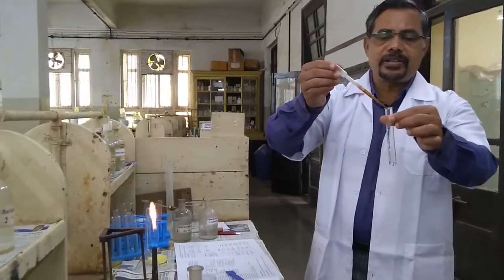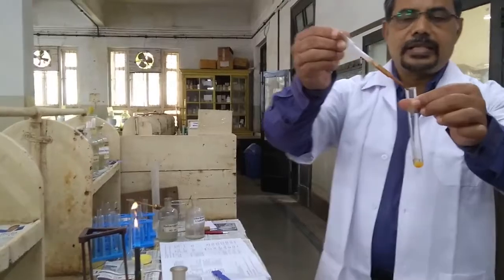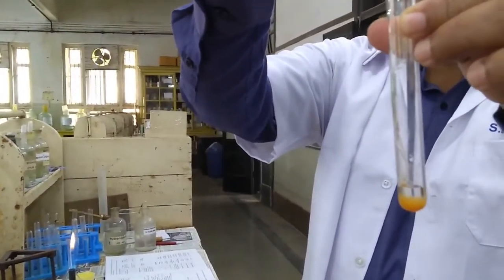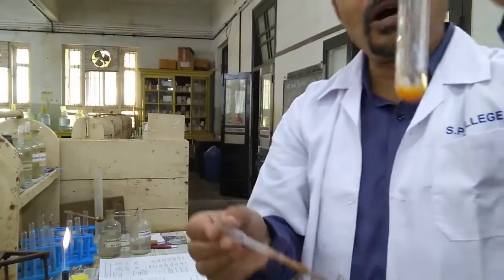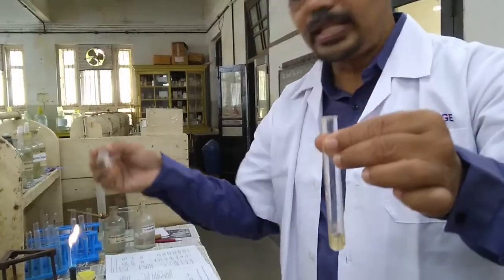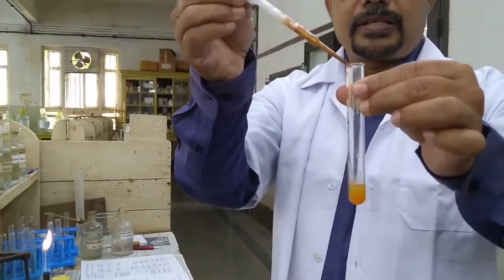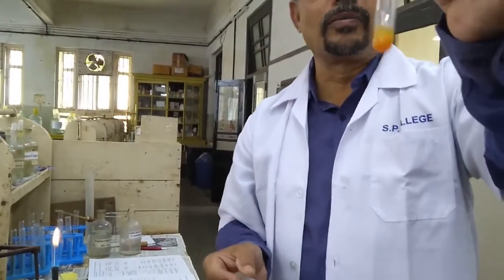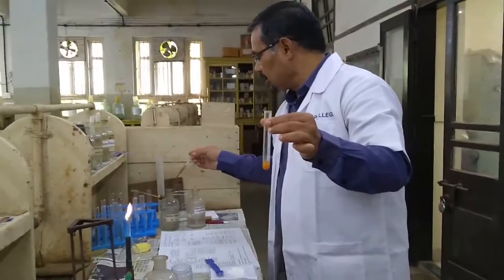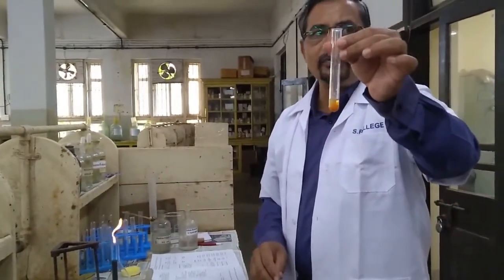If Nessler's reagent is added to the original solution, then see that there is a formation of a brown precipitate. So this reddish brown precipitate formation after addition of Nessler's reagent indicates the NH4 plus ion is confirmed. So this is about the first radical, that is the presence of NH4 plus radical in the given mixture.